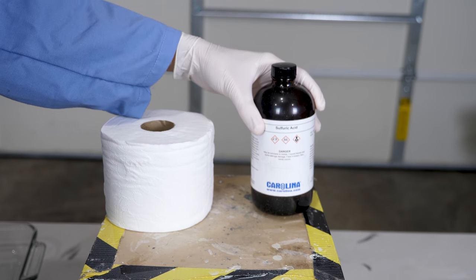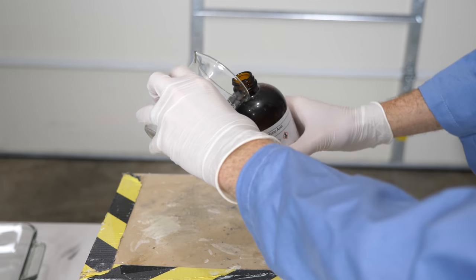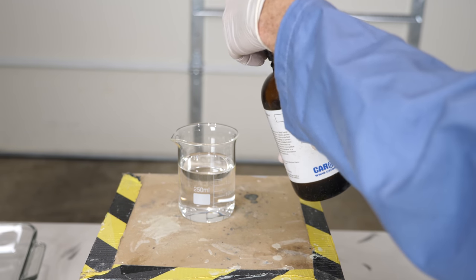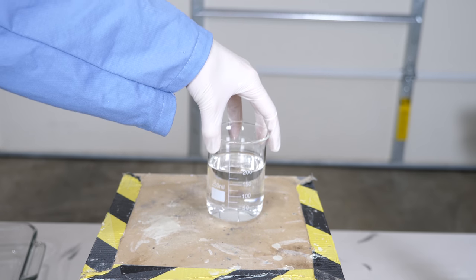Okay everyone, today I'm going to be pouring concentrated sulfuric acid on toilet paper. We'll get around 200 mils of sulfuric acid. Now this doesn't look so harmful, does it? It just looks like water.